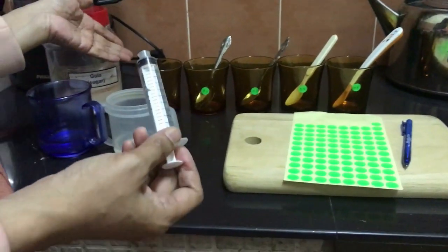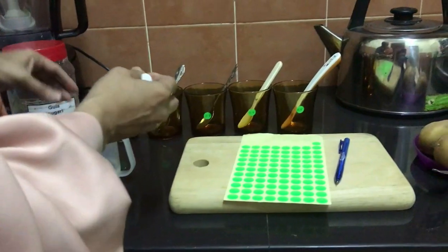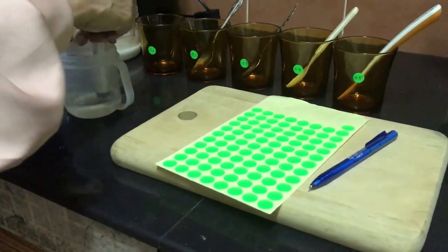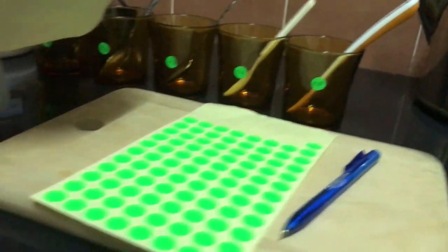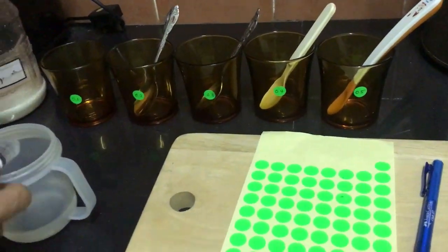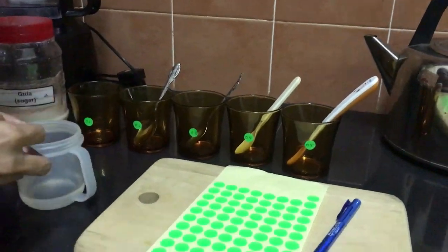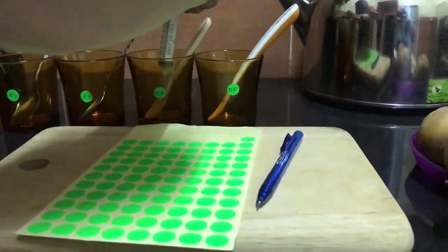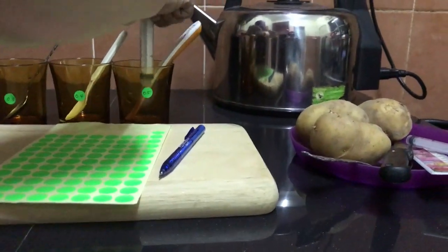After you make your calculations according to the table given in your lab manual, you need to take about 2 ml of sucrose and put it into the 0.1 molar drinking glass.